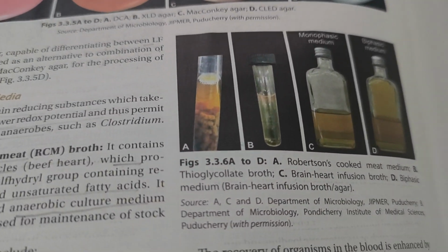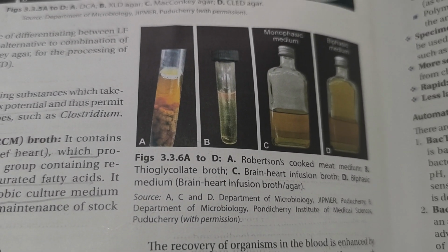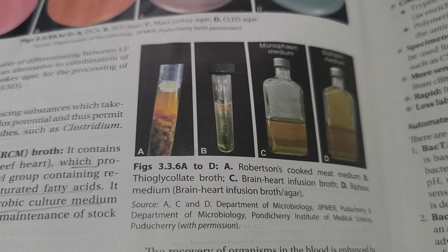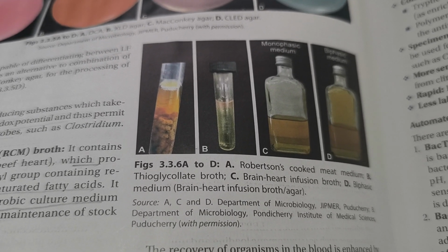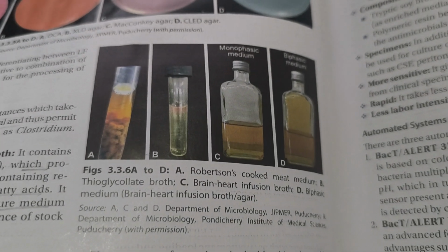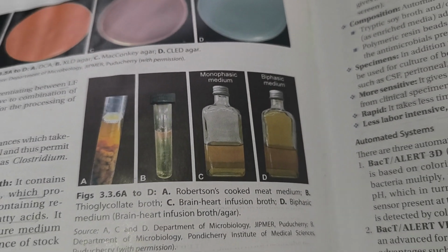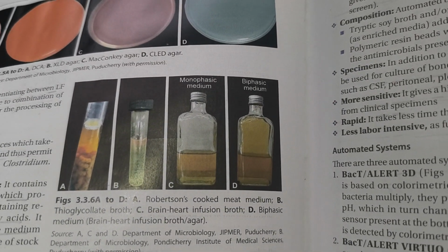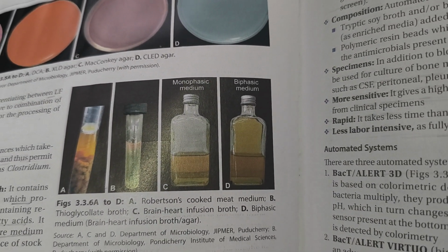Figure A represents Robertson cooked meat medium. Figure B, thioglycolate broth. Figure C is brain heart infusion broth, which is monophasic media, and figure D is biphasic media, which contains both solid as well as liquid broth.